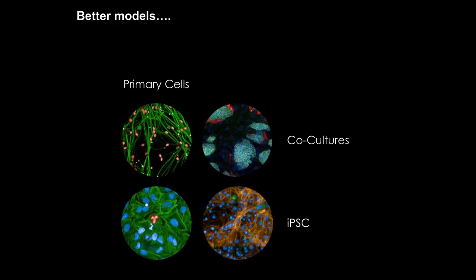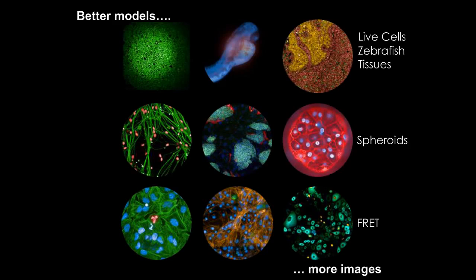Increasingly, we see even higher value models coming up. We're seeing more and more people working with live cells. We're seeing model organisms like zebrafish gaining in importance. We see a tremendous increase in working with spheroids and organoids, which are three-dimensional model systems providing a much richer environment for the cells to differentiate in ways that resemble the human body. And we see also an increased work with tissue slides. We see also more advanced models using, for example, FRET to look at protein-protein interaction.